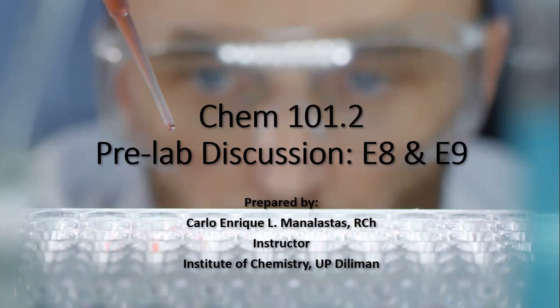Hi, so in this video, I will be discussing the pre-lab for experiments 8 and 9, which focuses on the two instrumentations involving chromatography.